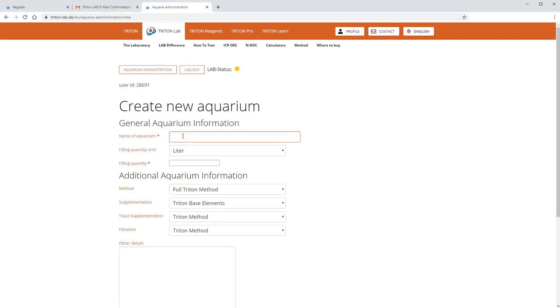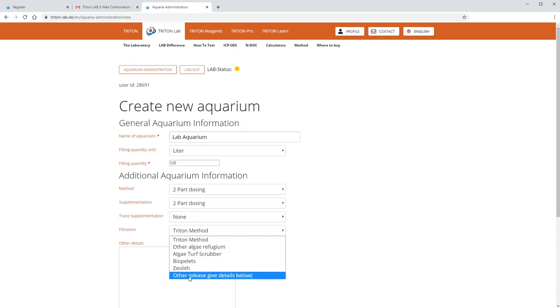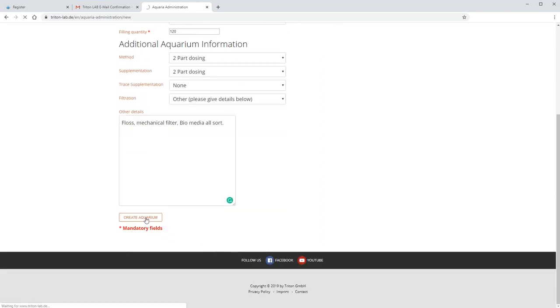Once all that is done, it's now time to create the profile for your aquarium. So I just put the information for the aquarium that I was testing. It's 120 liters, which is like 30 gallons or something. And try to be as close as you can be for the information because I think they use this for data, and the more data they have, the more precise they can be. So you can just fill up everything and you can create the profile.